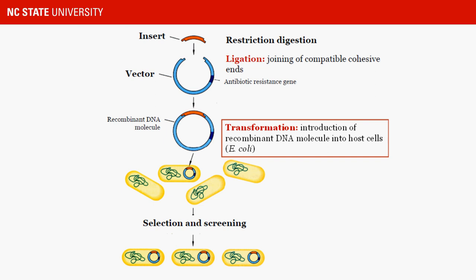Now, we have learned what a ligation is and how to set up a ligation reaction. Following the ligation reaction, the insert and vector DNA will join together to form a recombinant DNA molecule. Next, we want to introduce this recombinant DNA into host cells for selection and further propagation. Usually, we use competent E. coli cells as a host.